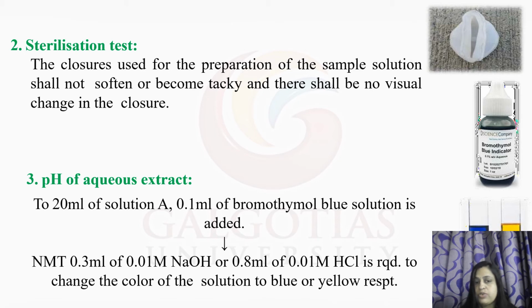pH of aqueous extract: to 20 ml of the solution A, 0.1 ml of bromothymol blue solution is added. Not more than 0.3 ml of 0.01 molar NaOH or 0.8 ml of 0.01 molar HCl is required to change the color of the solution to blue or yellow respectively.